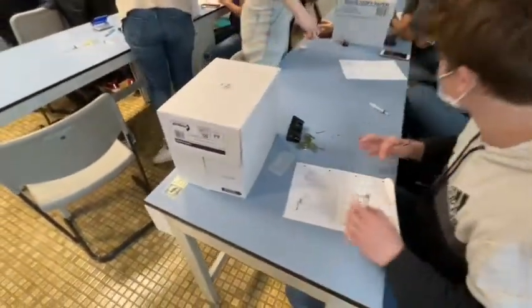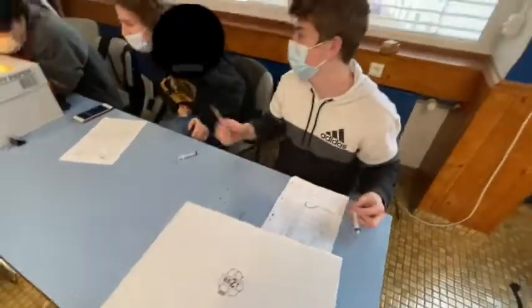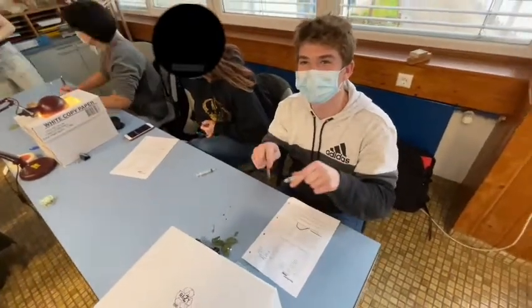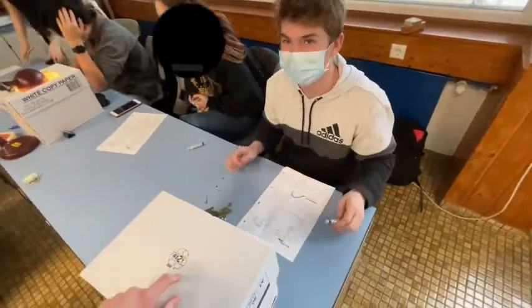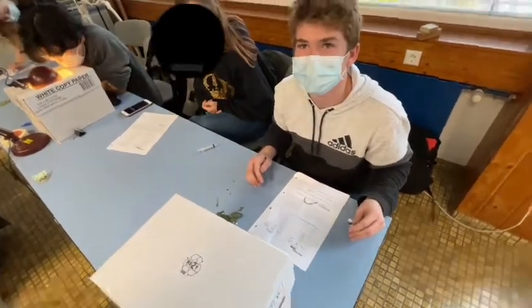Okay. So why are these not floating? Photosynthesis to create air pockets between. So is photosynthesis happening here or not? It's not. Okay, so there's no air. Okay. Alright, get ready. We got a floater. We got 1 floater.